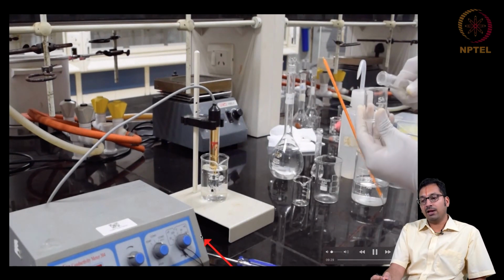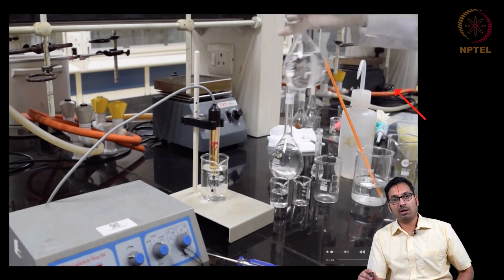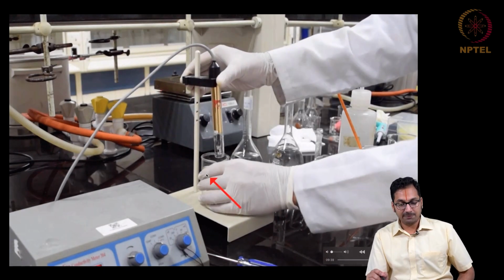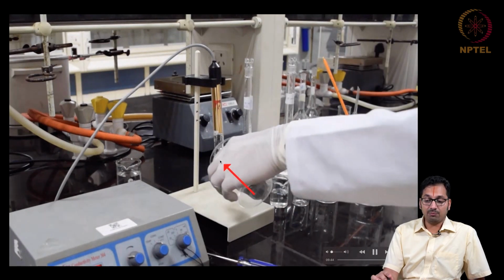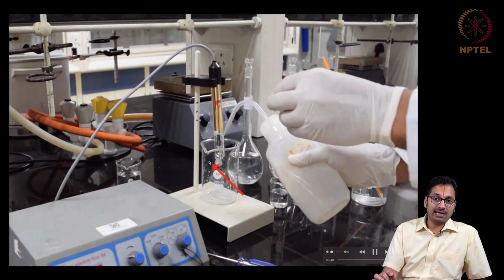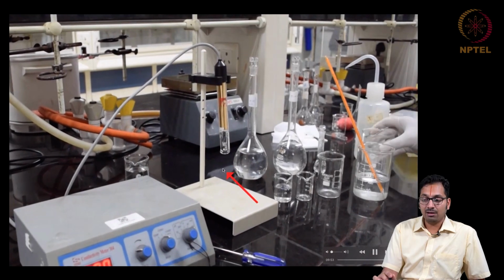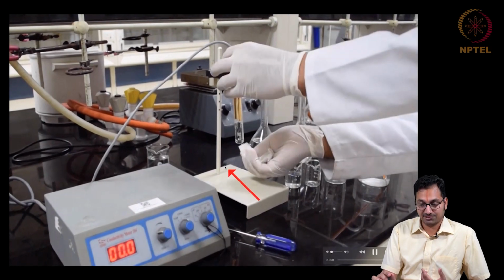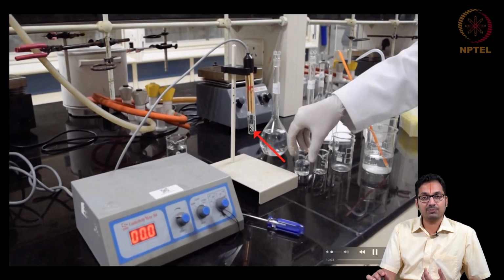So the first thing that we would end up doing is to calibrate this conductometer. He is adding the 0.01 molar KCl solution from the volumetric flask that he has made up into the solution. And before you end up using the probe, the first thing that you must do is to always wash the probe, irrespective of which one you are doing. Wash it carefully such that no damage occurs to the probe. Wash it enough with water and dry it with a paper that doesn't get stuck or result in scratches. So you have to be extremely gentle when you remove the water. You just touch it and it actually absorbs all the water.